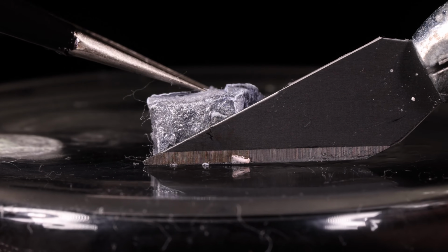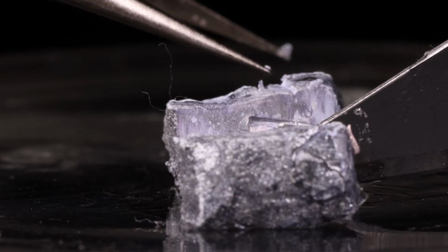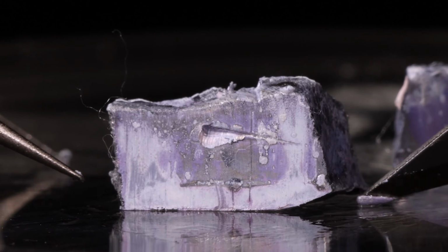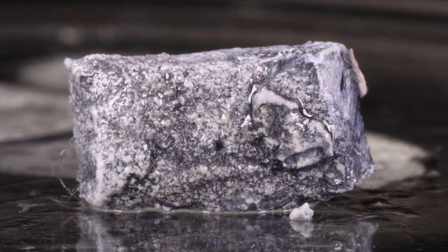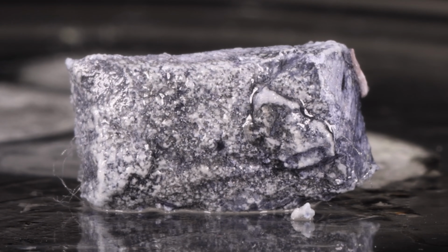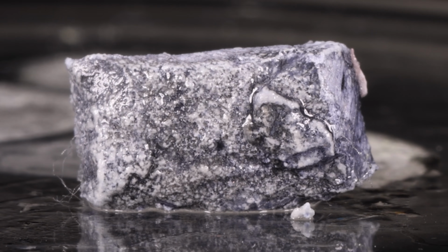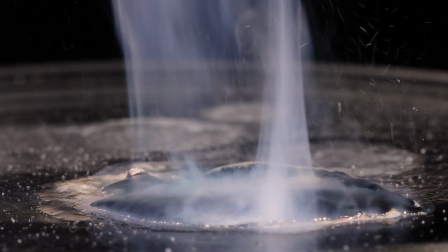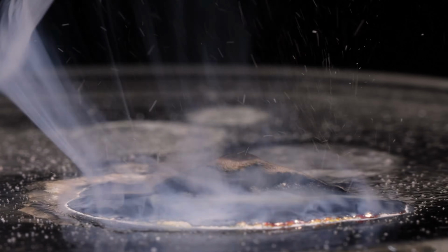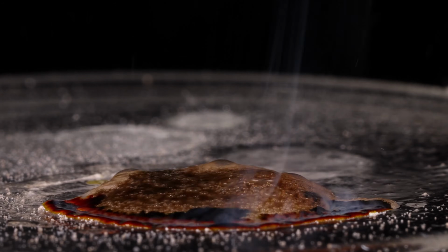Now I wanted to show you what potassium looks like up close. It's a very soft metal. You can cut it with a knife or even with your fingers. Notice how shiny it is. Right after you cut it, it's shiny, but it reacts almost immediately with the water in the air, turning it a much more dull color. And also it's bubbling there. It's reacting with the water vapor in the air, producing hydrogen. And in fact, if you put water on it in real time, the reaction is over almost immediately and turns into a puddle of goo. Well, it's really potassium hydroxide and water, but you get my meaning.